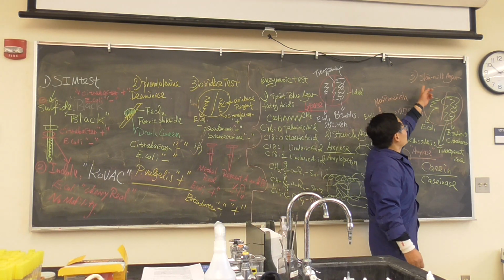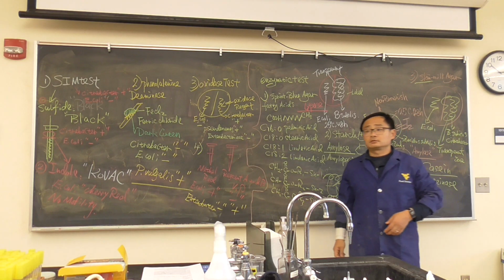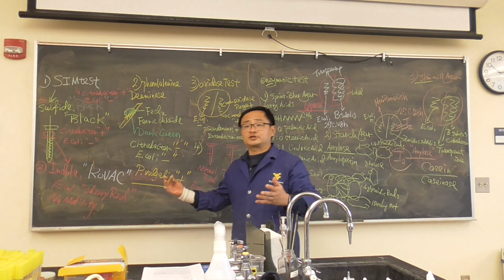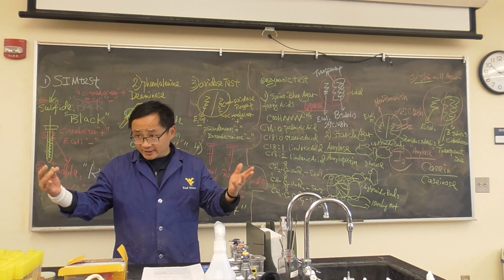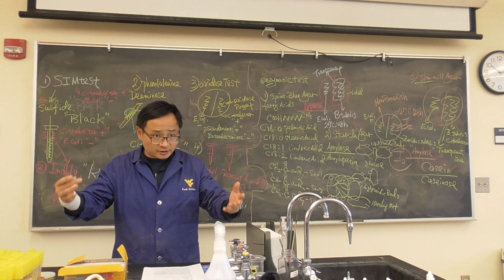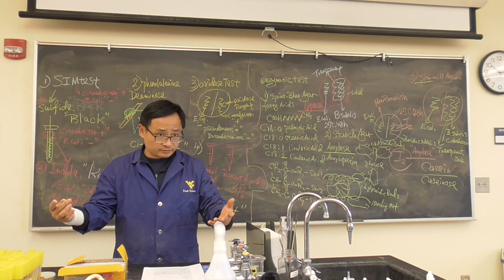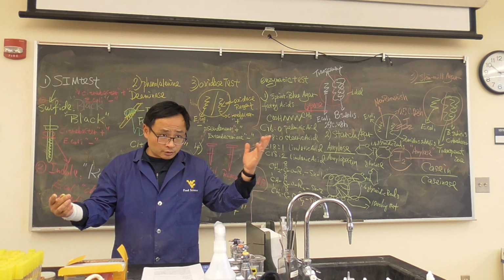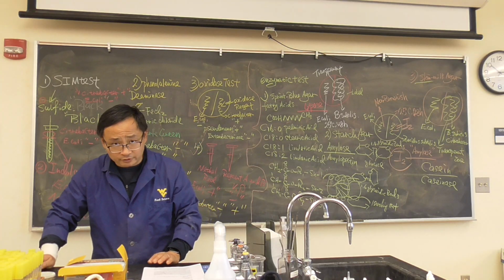But the question is, why do you use skim milk agar? What do you skim? That means 0% fatty acids. We don't want the fatty acids there because otherwise they will interfere. So we use 0% fat milk, that is called skim milk. If you go to the grocery store, you get a bottle of whole milk. What's the percentage of fat?